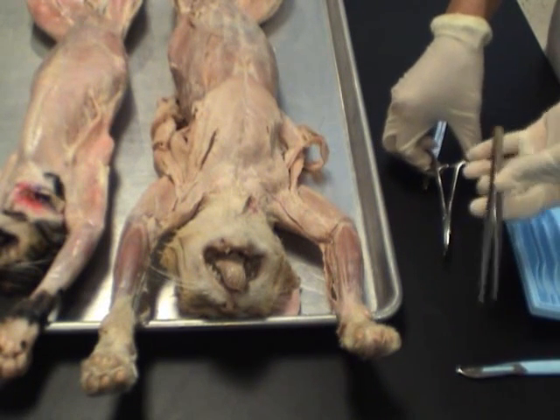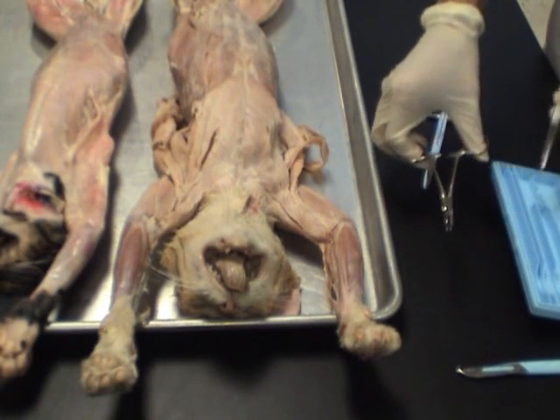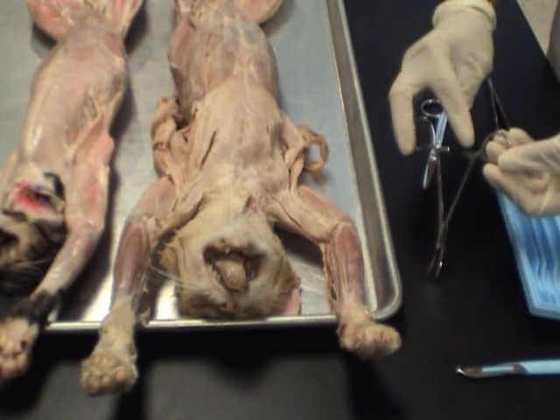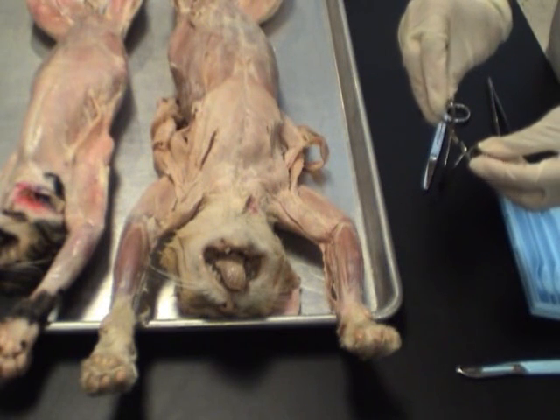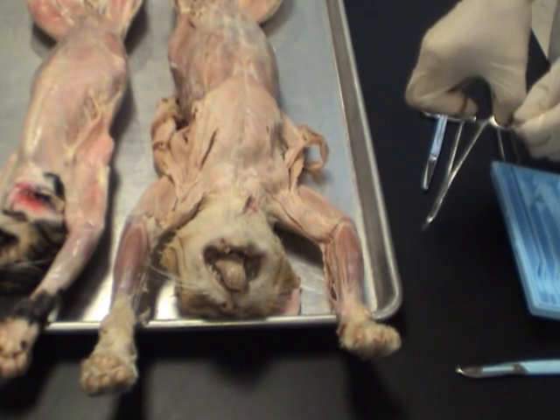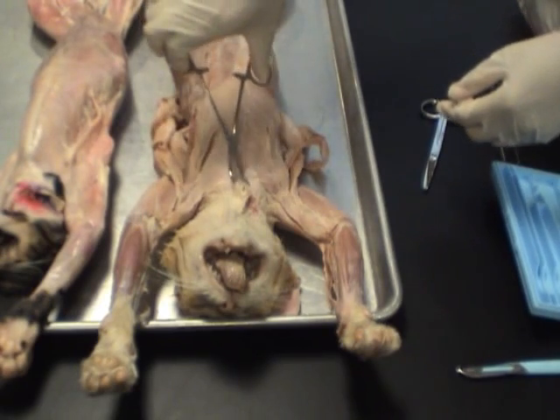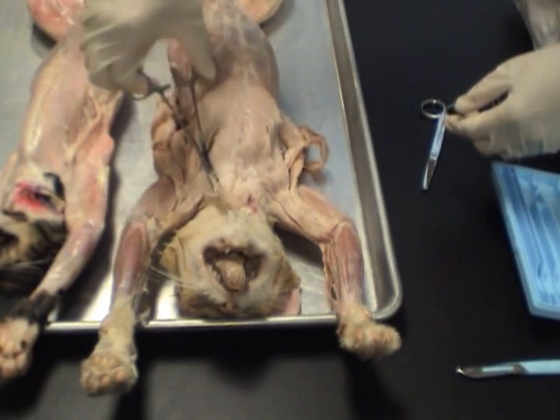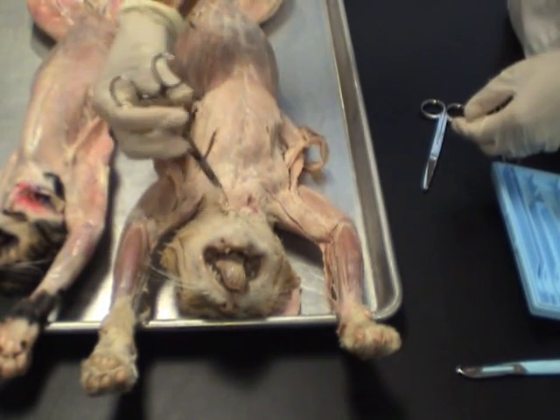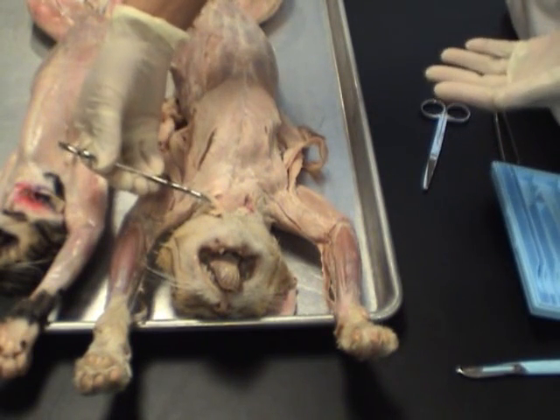Tweezers were another holding instrument that we talked about already. But the problem with tweezers is that your fingers will get tired after holding like this for a long time. If that's the case, use these. These are hemostats, because what you see is there are ridges here, and the ridges will allow this to snap and hold in place. So for example, you have to release the tension. Let's say I want to hold this once again. I'm going to clip onto it, click to hold it tight, and at this point it's easy to hold like this, and you can hold it like this for a long time without your hand getting tired.